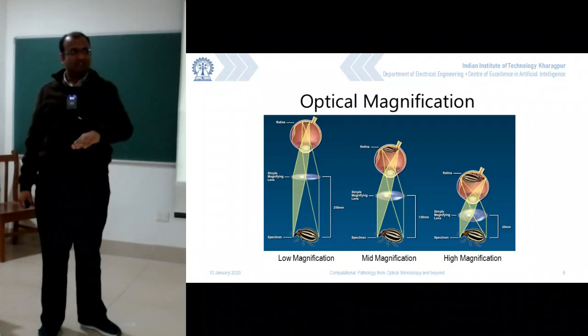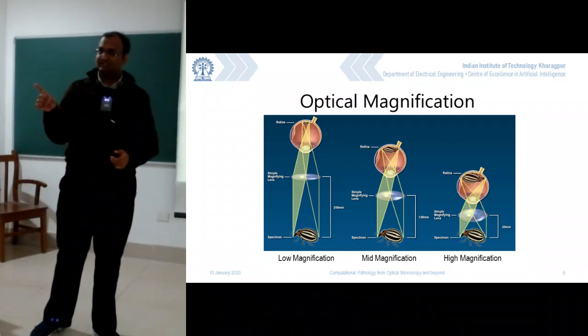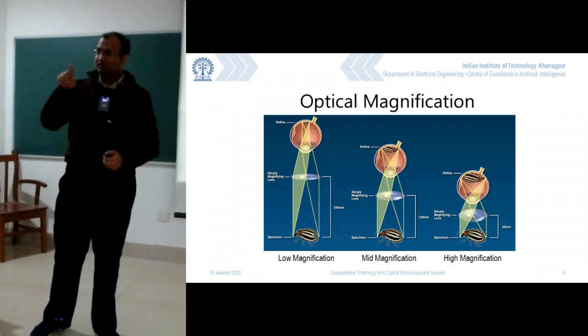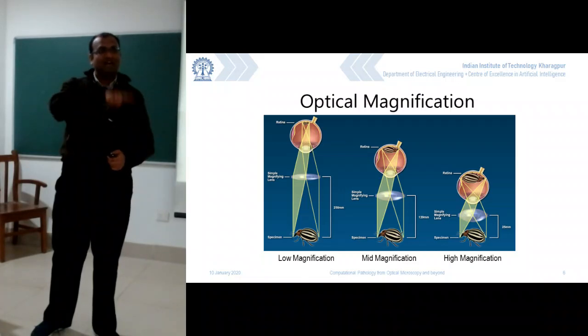So essentially an optical magnification will also hit a limit at a point of time. In fact, lenses which have a higher magnification factor, which is also dependent on the focal length, so a shorter focal length lens will have a higher magnification factor, also has a higher curvature, which means that the bulge is much more, so that restricts itself.